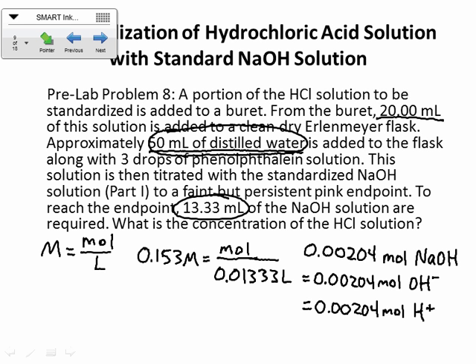Okay? So actually, it doesn't really matter that I diluted it. Now, so then why did I do it? And what was the point of this person diluting this solution before adding the NaOH?